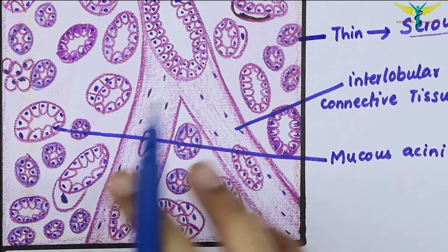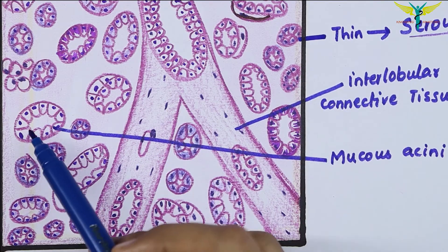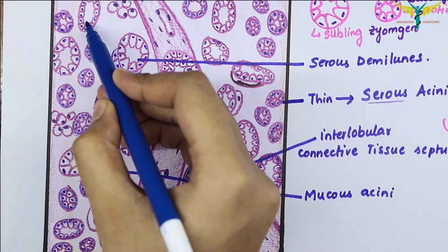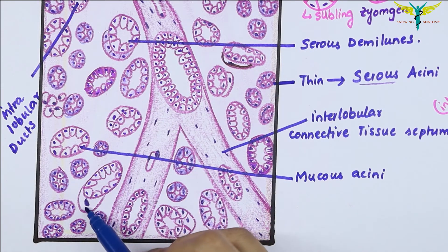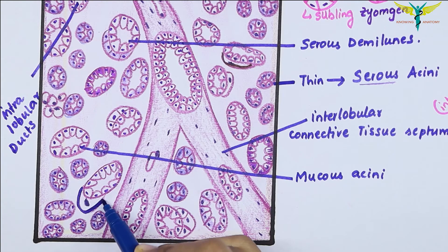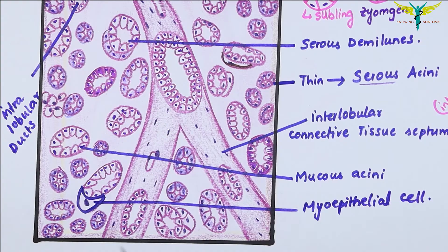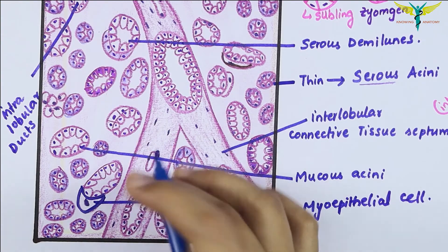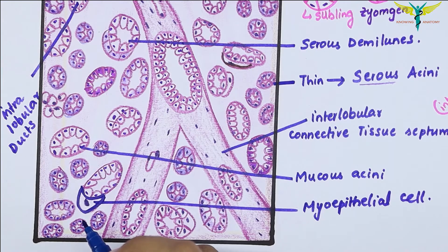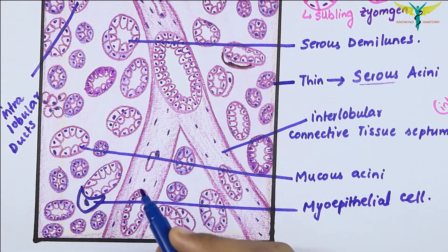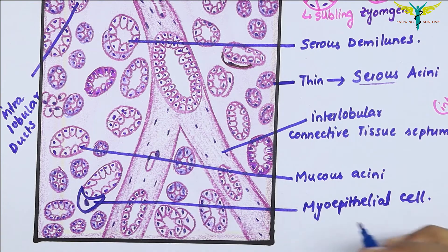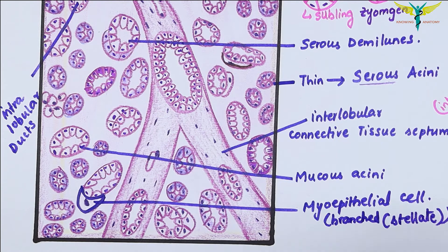The mucous acini are lightly stained and contain thick mucoid material inside. There is a presence of some intralobular ducts, and adipose tissue is present throughout. The myoepithelial cells are present in relation to the acini and to the intercalated ducts. These myoepithelial cells are located on the acini and are often branched, forming baskets around the acini — they can be branched or stellate.